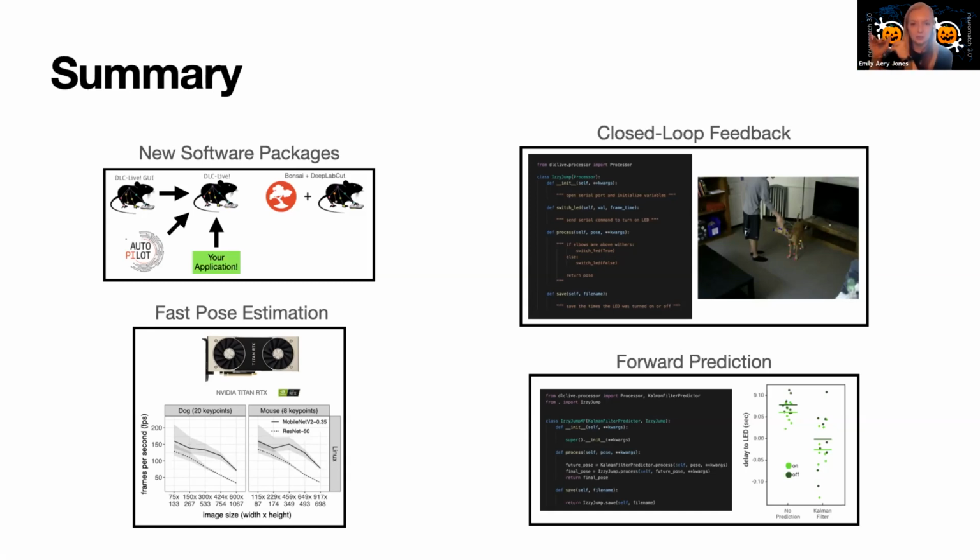many orientations? Correct. So if, for example, I'll just keep talking about Izzy, my favorite subject. In this image right here, you can see the right paw is further from the camera at this point, but if Izzy was turned around in the opposite direction, then the right paw would be the closer limb.